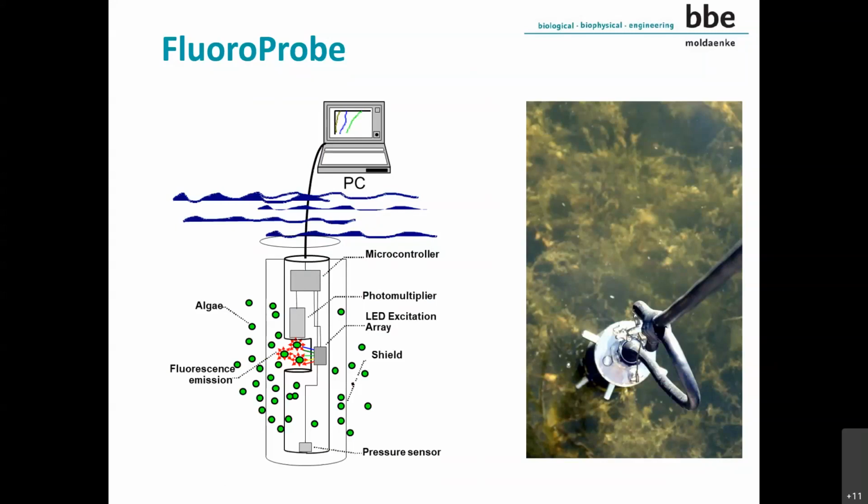these measurements. Not only get the information about the algae content in total, but also get the information about different algae classes. Because here we can not only get the information about cyanobacteria, but we can differentiate between different algae classes up to 5.